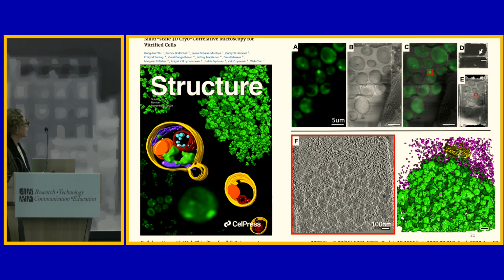We were looking at the fluorescent regions of interest on a cryo sample. This sample would move into the SEM FIB to mill a surface. And then you can overlay that fluorescent image to find your regions of interest. If you take this sample and you tilt it 90 degrees, so you're looking at it from the perspective of the FIB beam, it looks like this.